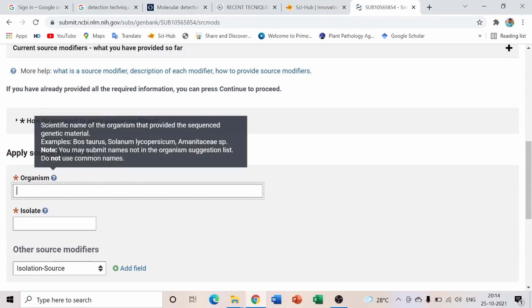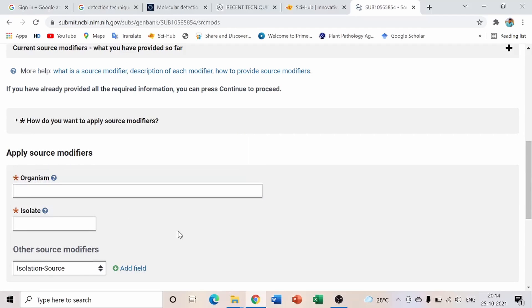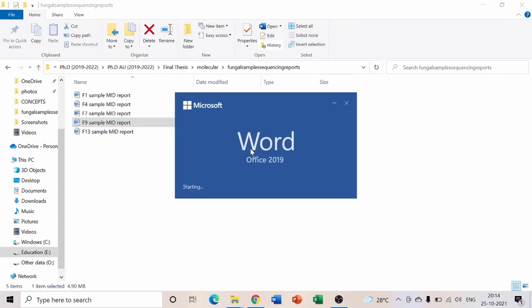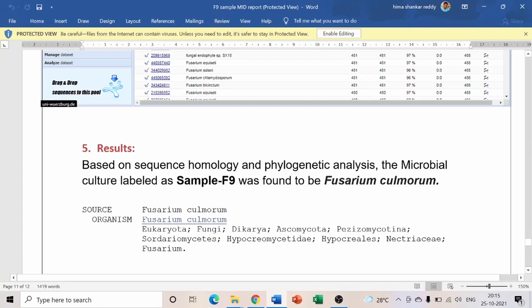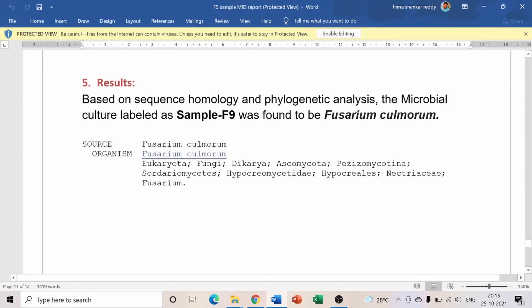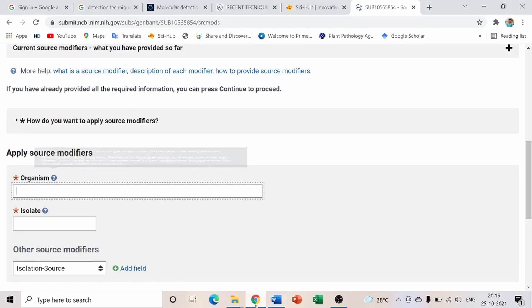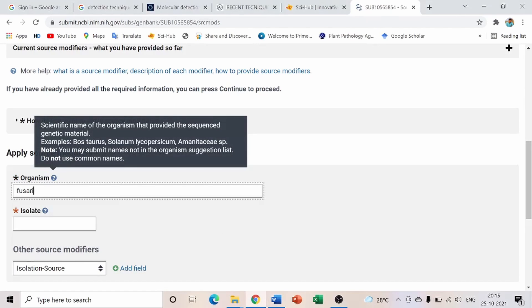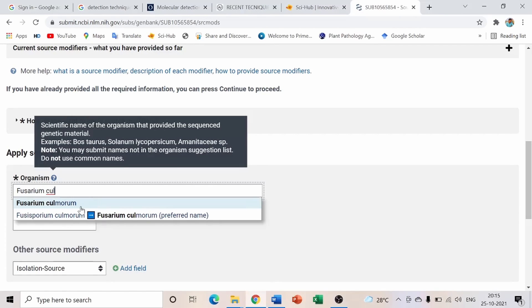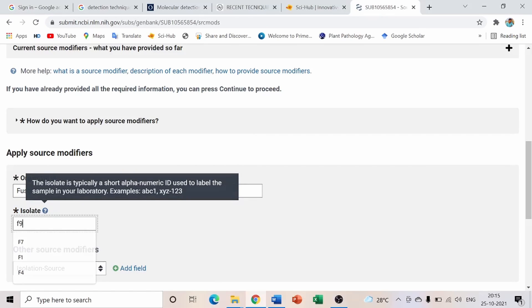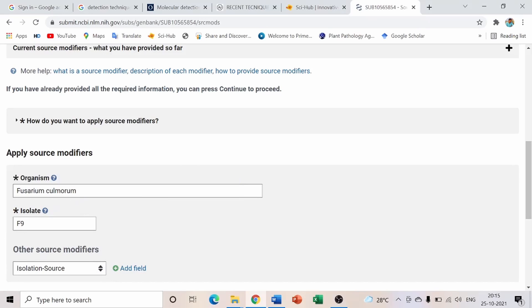In the Source Info step, enter the organism name. Looking at the sequencing result for isolate 9, it is identified as Fusarium culmorum. Type 'Fusarium culmorum' and the preferred name will appear as a suggestion — select it. Then enter the isolate number, for example F9.